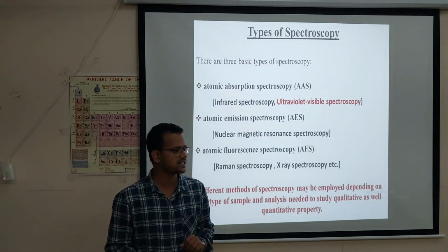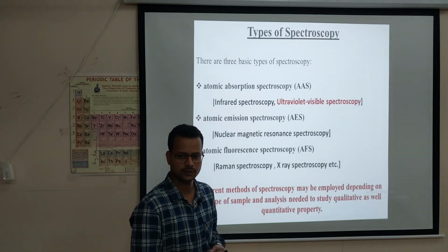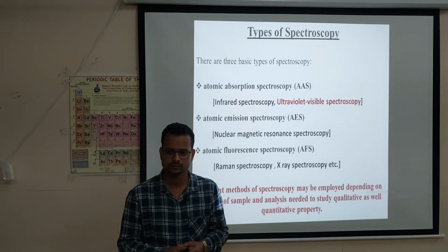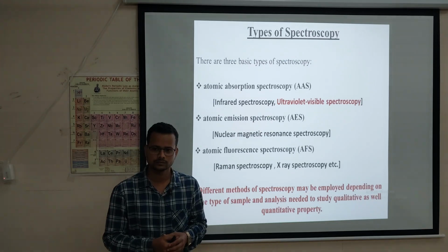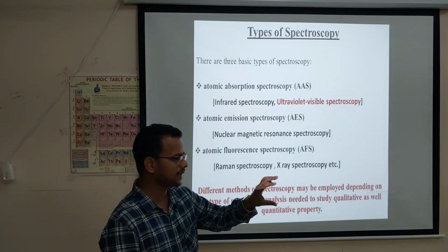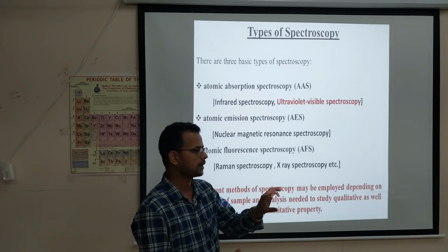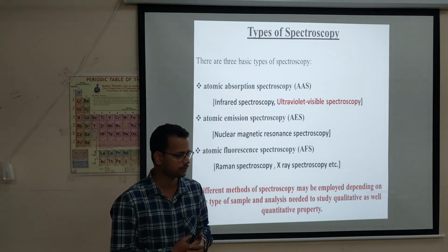So, the first question arises here: why is it called absorption spectroscopy, right? Light gets absorbed, and this phenomenon can only be explained when the light is incident or when the light is absorbed, right. Actually, in this spectroscopy, we predict the nature of a metal or any type of sample on the basis of absorption of photons. How many photons it has absorbed.